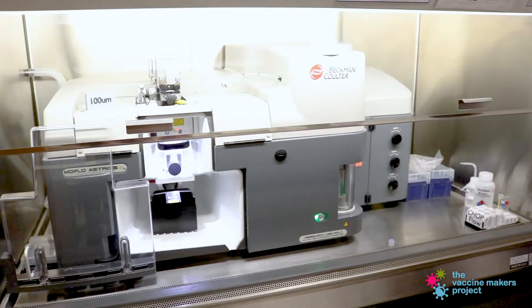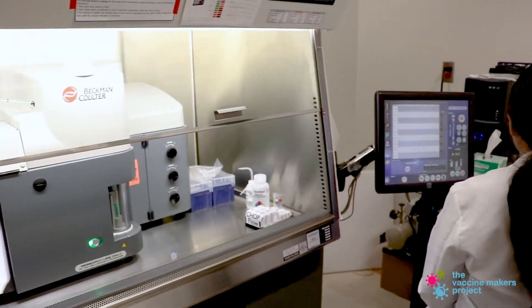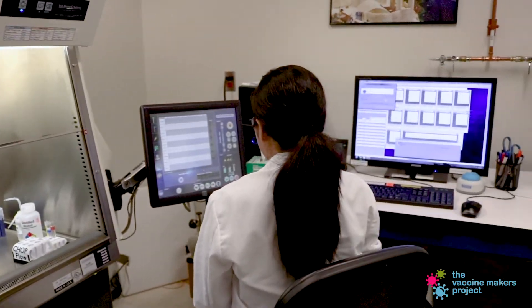In flow cytometry, we use different types of instrumentation to measure different groups of cells and to separate and collect the cells of interest from the rest of the sample.